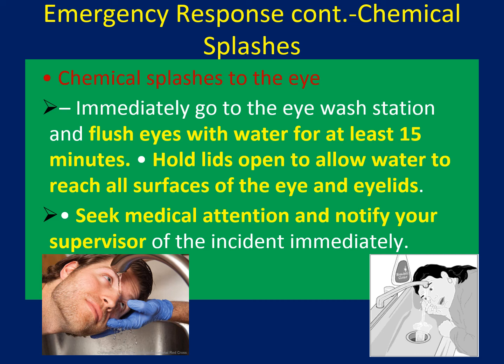So seek medical attention immediately, because the eye is very sensitive to many chemicals, and the chemicals can irritate your eye. Even if it is not visible at first, after a few hours the symptoms will be observed. So that's why I'm always telling you to seek medical attention in case of splashing chemicals into the eye.